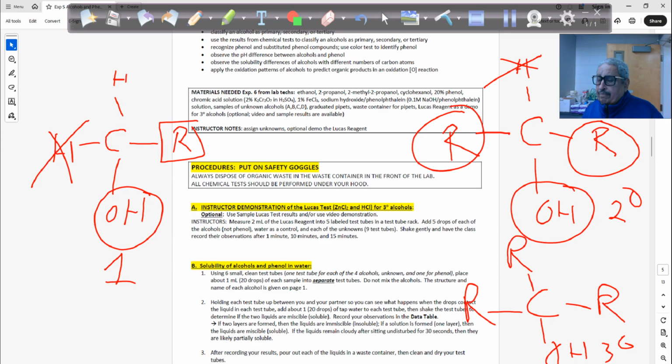They bridge themselves with the OH as a solvent, making hydrogen bonds. The last reaction: somebody should tell me, what's unique about phenols? We use phenol in the bathrooms, for cleaning up the bathrooms, and you have to keep it out of the reach of any child. Phenols are weak acids, so we have to test. All alcohols are neither acid nor base.